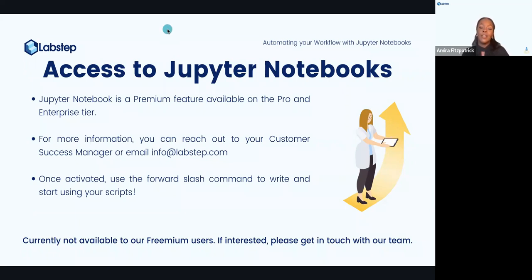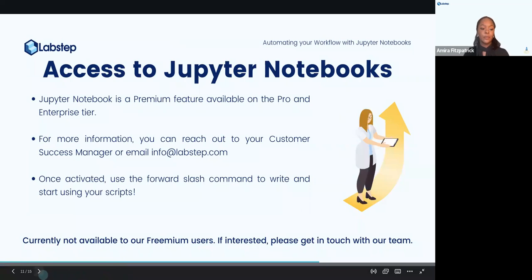If you are a free user, part of the freemium tier, Jupyter Notebooks isn't available, but if you are interested, you can get in touch with us and we can see what we can do for you. As you can see, we have a few polls running, so you can answer those in your own time. And I will just go ahead to the next slide.